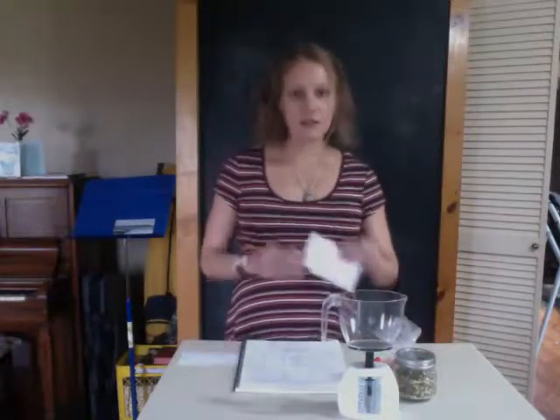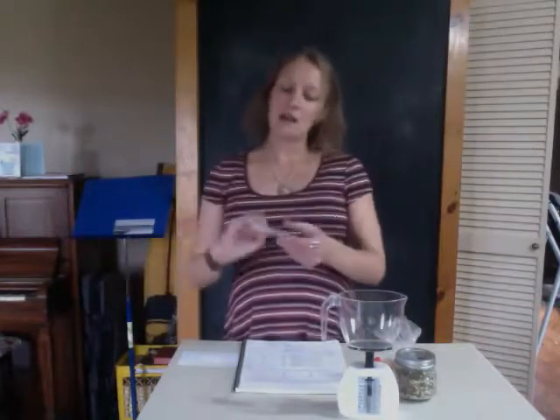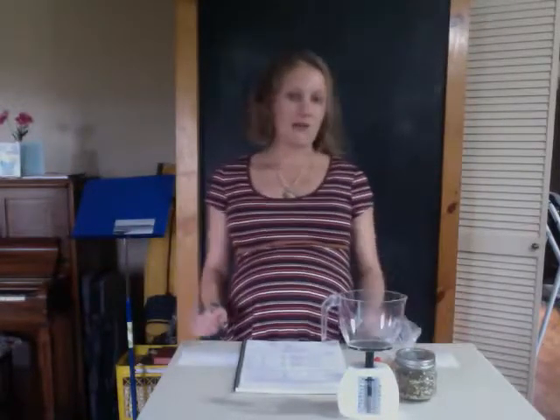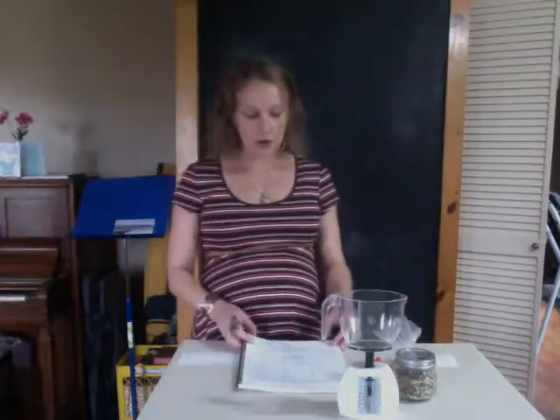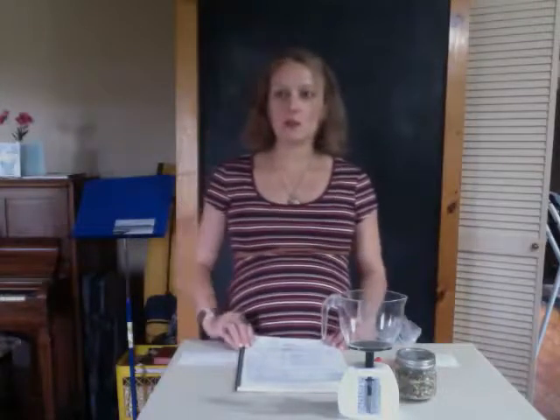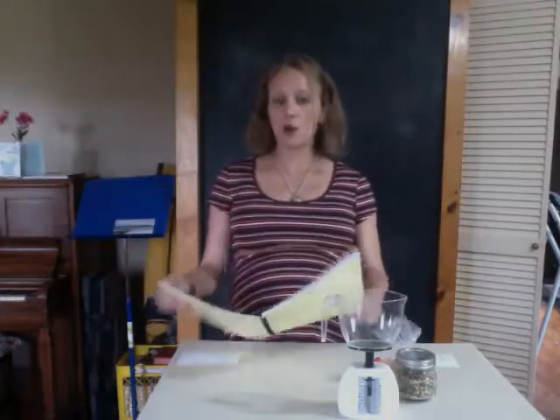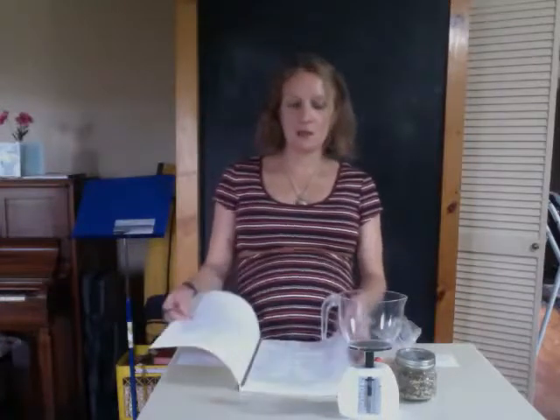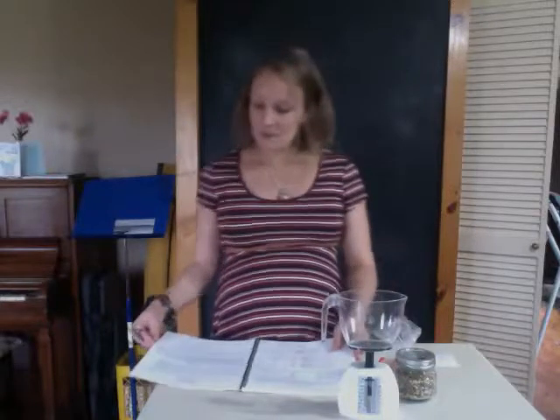So this is lab 1. We're working on averages and also standard deviations, or average deviation, as they call them in your book. You have the option in this class to either print the lab directions off of Blackboard, or you can get a manual such as this that they'll be selling in the bookstore. I'm using this for guidance here.